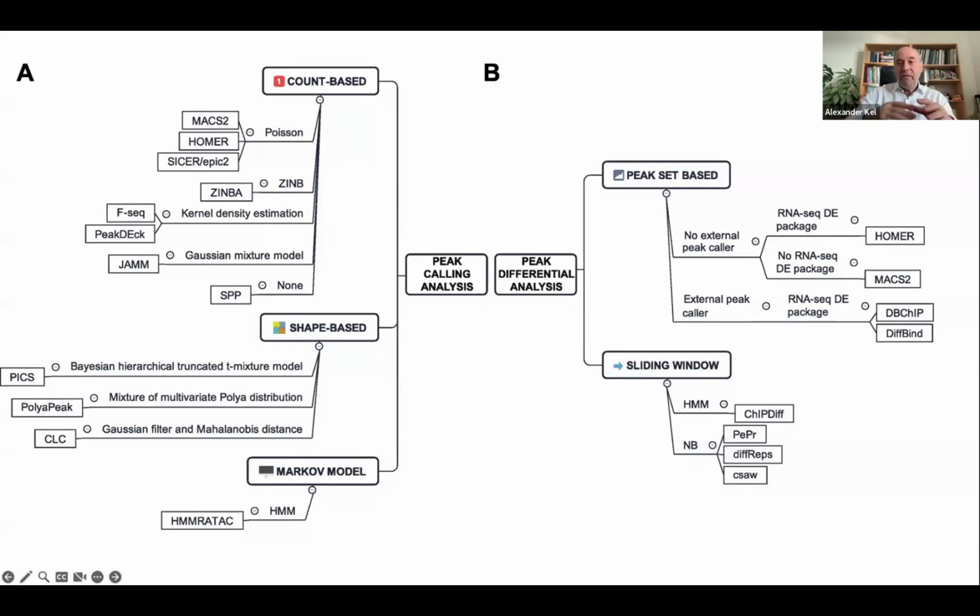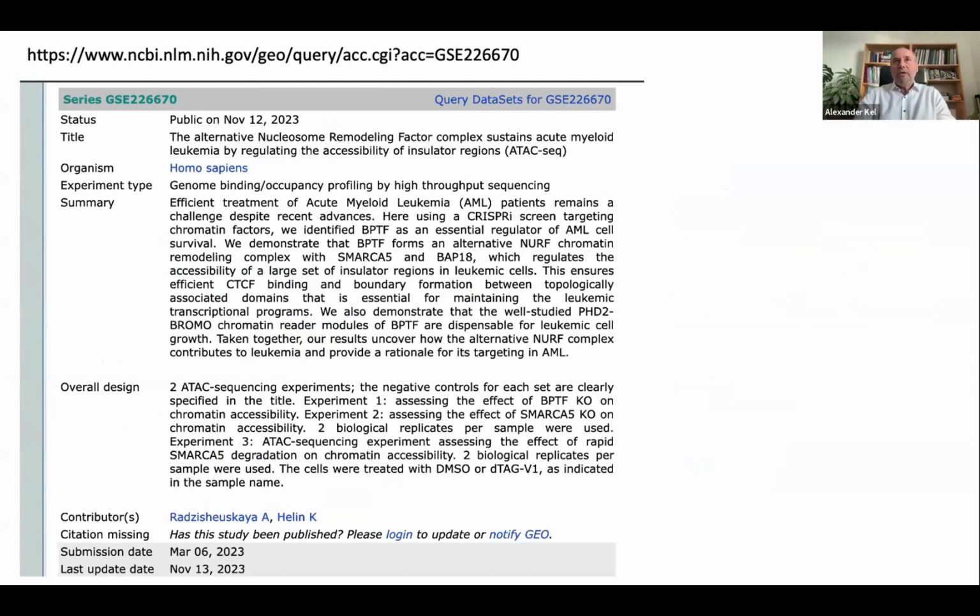If you have those hills and valleys of number of reads, then this gives you a particular shape. For instance, as I said, when a transcription factor is occupying some place, there is the shape of a little valley. So this kind of information can be used to analyze those peaks and to predict them. There are a number of tools which can do that, and you can find those tools in various packages. All right. But today we'll go through one example to actually analyze this data and to show how tools can help to analyze that data.